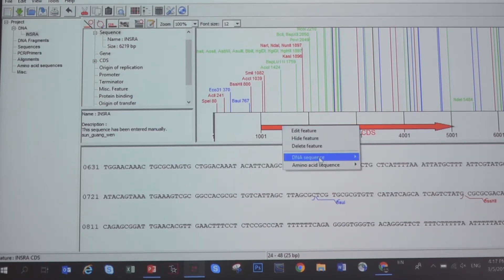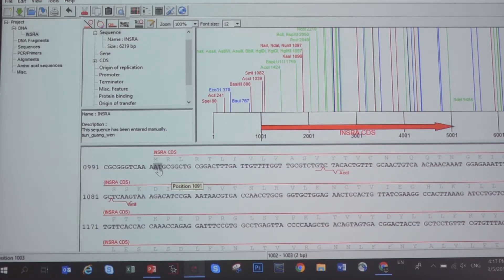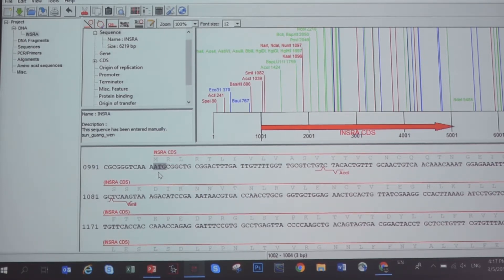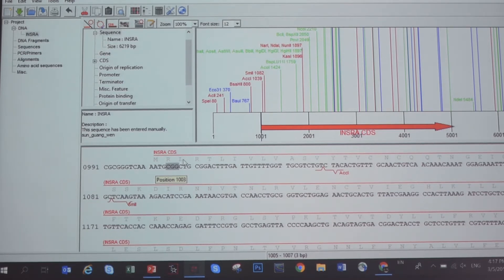The same thing for the coding sequence mark is shown. Just now I asked you to choose reading frame number one, which means the translation will start from the first position. The codon is a triplet codon — every three nucleotides represents one amino acid. The single letter on the top represents the standard 20 amino acids.